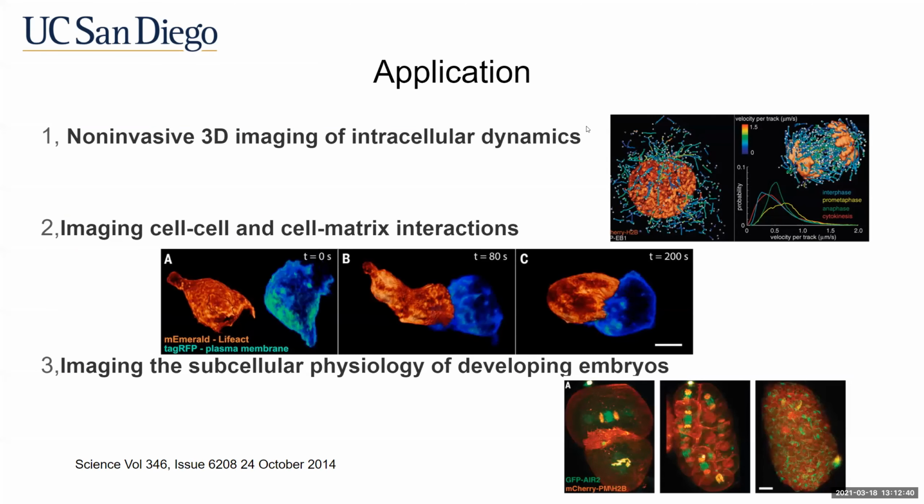One of the applications is noninvasive 3D imaging of dynamics. The second one is imaging cell-cell and cell-matrix interactions. The third one is imaging of the subcellular physiology of developing embryos.